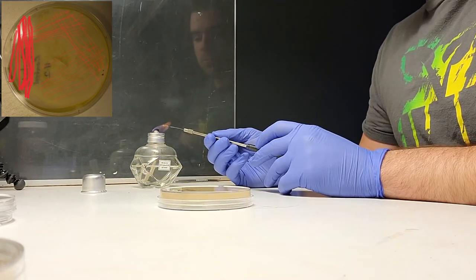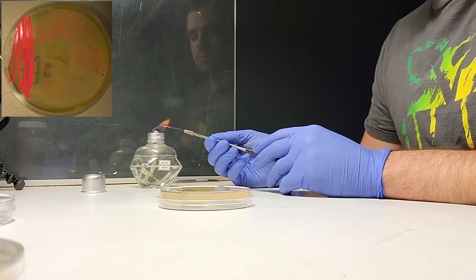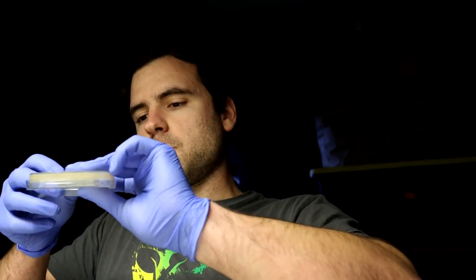That should give me isolation. I have one extra plate and I'm going to do the same thing again to up the odds. No culture is too contaminated — remember that. At least I should remember that looking back on this.